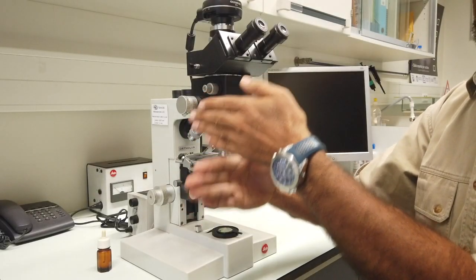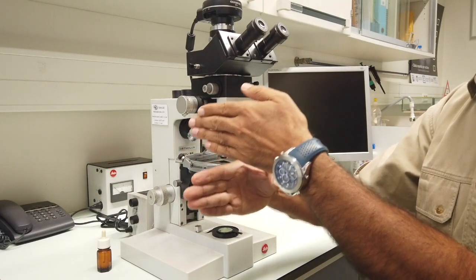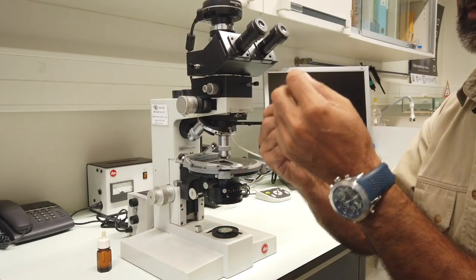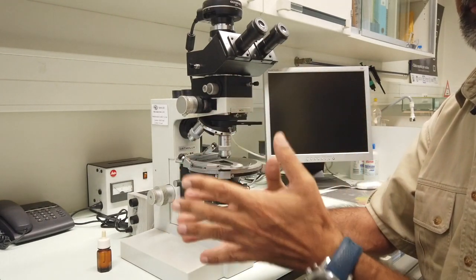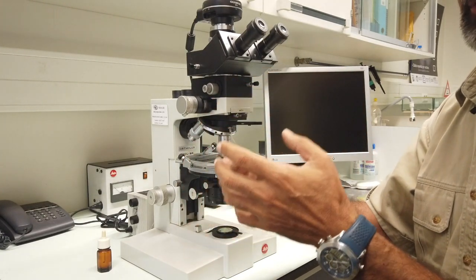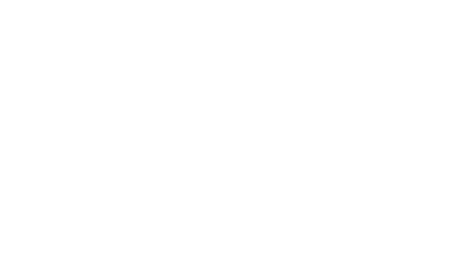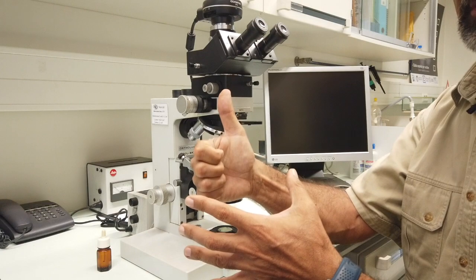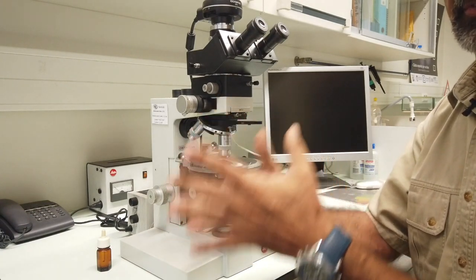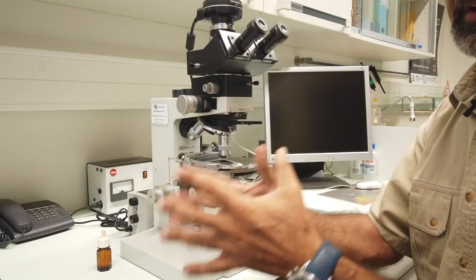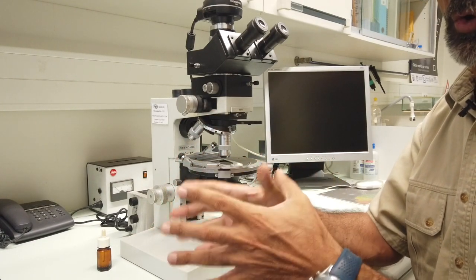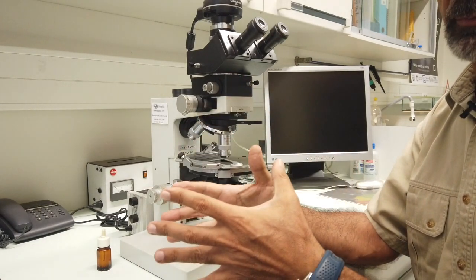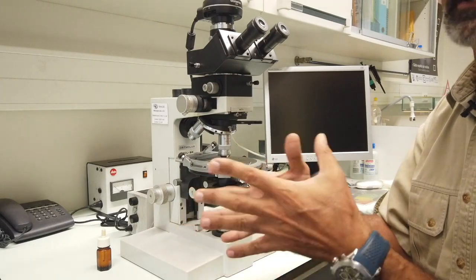Everything that is isotrope or of the cubic system, minerals of the cubic system or organic matter that does not interfere with the light, for instance, diatom frustules or objects that have the optical axis on the vertical and those also don't interfere with light. In all these cases, they become extinct. All the others that are mineralogic and anisotrope, they interfere with light and can be visible.